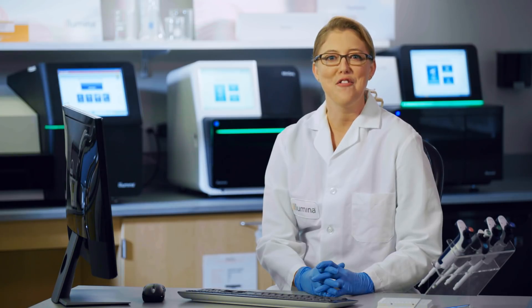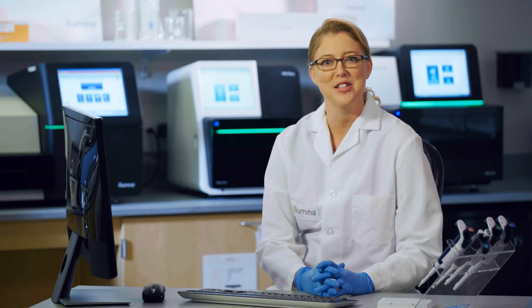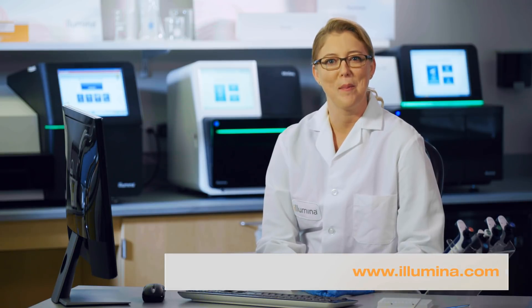Together, AmpliSeq for Illumina library preparation and the power of Illumina SBS sequencing offers a highly scalable and confident approach to targeted resequencing. Now you can experience targeted resequencing amplified. For more information on AmpliSeq for Illumina products and workflows, visit the AmpliSeq product and support pages at www.illumina.com. And as always, if you have any questions, please feel free to reach out to Illumina Technical Support — scientists just like you are available and happy to help. Best of luck experimenting.